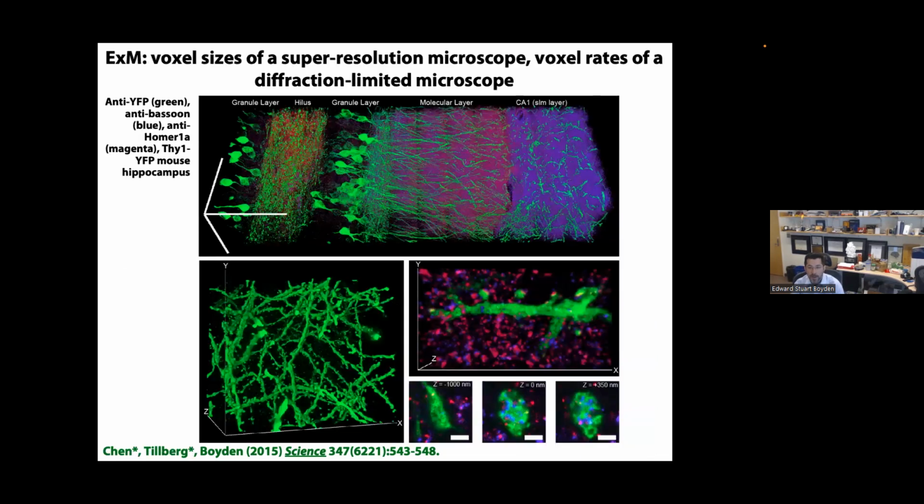So one take-home message is that now regular microscopes can do nanoimaging, but also you get a speed up because a classical microscope can go basically as fast as you want, right? If you're doing classical super resolution imaging, you're basically, in some forms like STORM or PALM, imaging individual molecules. But if you're scanning a laser or scanning an array of lasers or doing other classical diffraction limited methods, you can go at blazingly fast speeds.